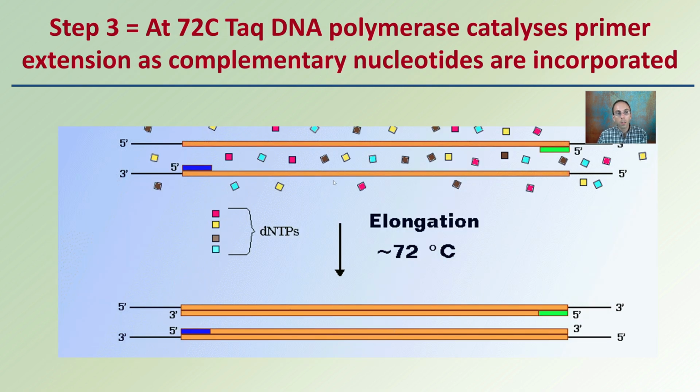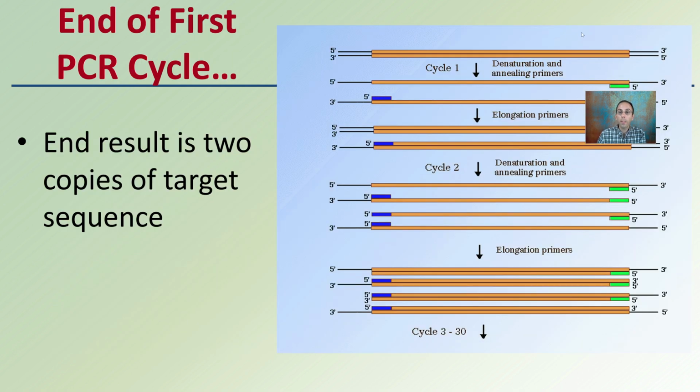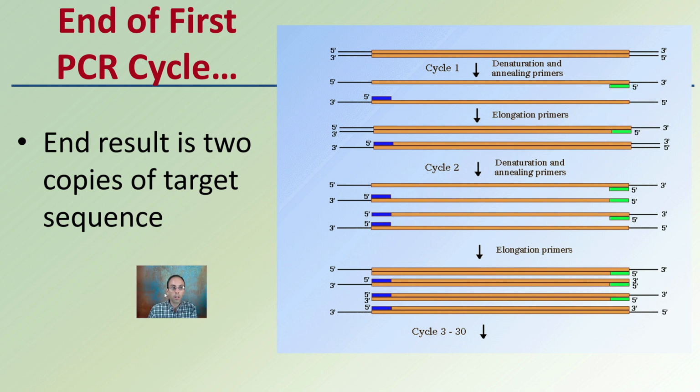bonds, may be present. Step 3, at 72 degrees Celsius, the Taq DNA polymerase catalyzes the primer extension as complementary nucleotides are incorporated. So we heat up to approximately 72 degrees Celsius, and this allows the polymerase to go through and attach these nucleotides to now make two new double-stranded sections of DNA over that target sequence. And this is the end of the first cycle. So the end result is 2 copies of the target DNA sequence.